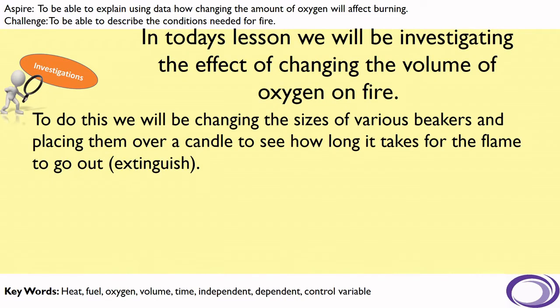Now in today's lesson we will be investigating the effect of changing the volume of oxygen on fire. To do this we will be changing the sizes of various beakers and placing them over a candle to see how long it takes for the flame to go out or extinguish.